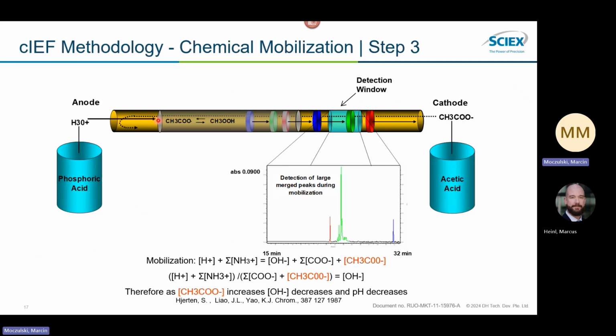And by decreasing pH, we are able to protonate each created zone, starting from the cathodic stabilizer, arginine, then from the highest to lowest pI value of the gradient. And because of that, each protonated zone, when passing through the detection window, can generate a signal. If we have real peptides or proteins passing through these zones, we observe this effect as peaks on the electropherogram.